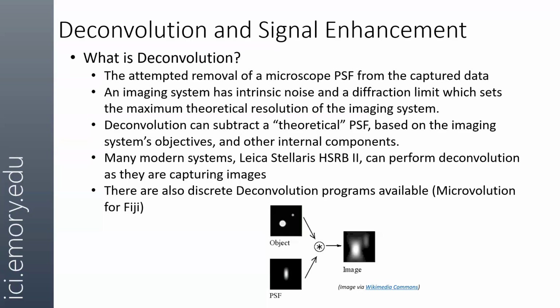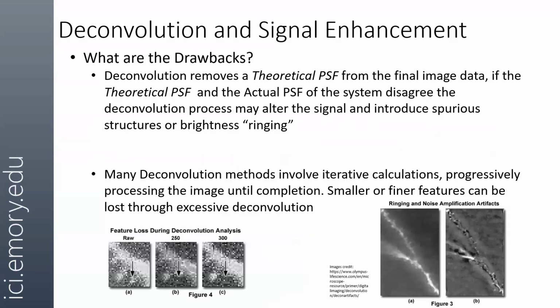Yeah, definitely. On our workstations, we've got Microvolution if you all end up needing it. But as with any filtering or data treatment, what are the drawbacks? The issue with deconvolution is if you over deconvolve something, if you don't have a good idea of what your PSF is, if you don't have a good theoretical PSF, probably don't do decon. If you have to, these are some of the issues you might see. If you over deconvolve, you can start erasing signal.